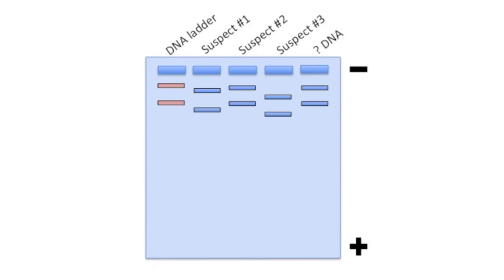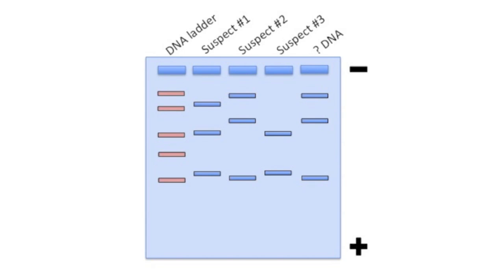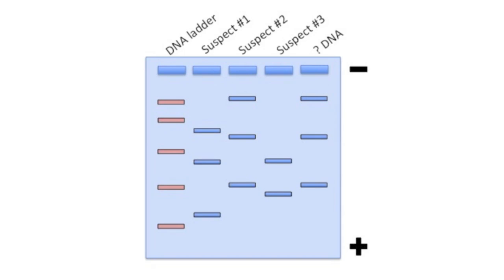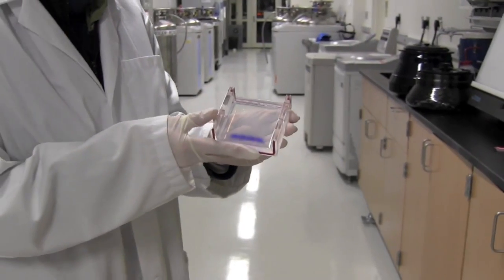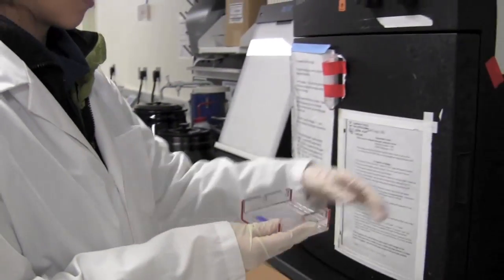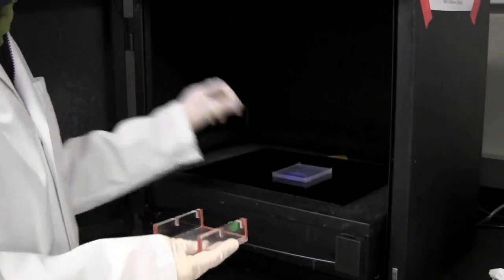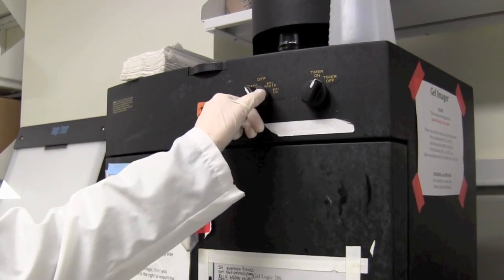Here is an illustration of how the DNA moves when the gel is running if we could actually see what was going on. As you can see, all the DNA bands of different sizes start out clumped together at the wells and then slowly separate based on size over time. Now that our gel has finished running, we can visualize the bands in a gel imager using UV light. The gel imager is connected to a camera that then takes a picture of the gel with the DNA bands visible. These are examples of what gels visualized under UV light with a gel imager look like.